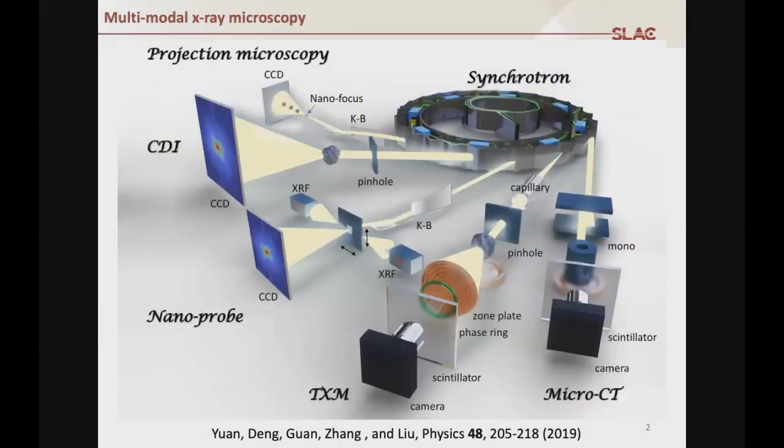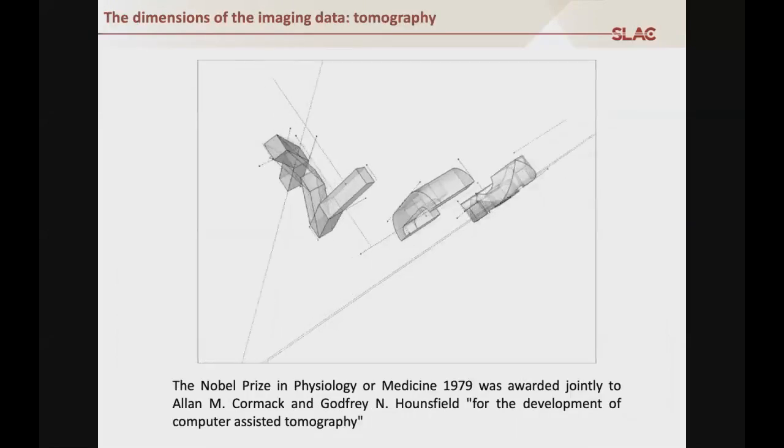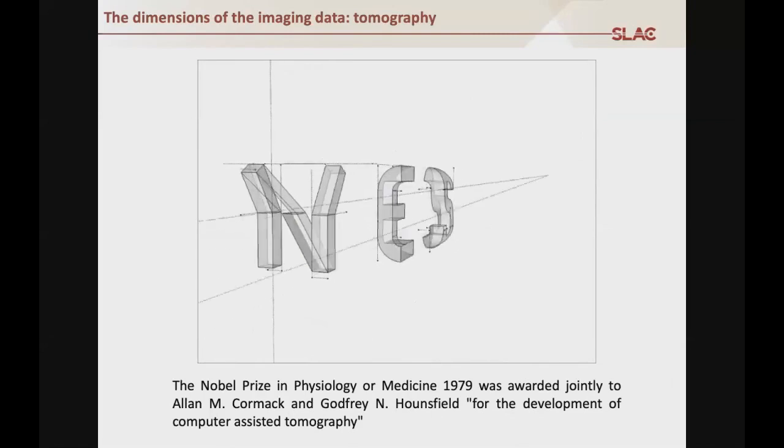X-ray has been used for imaging ever since it was discovered. In more recent years, thanks to the development of the synchrotron facilities, many different X-ray modalities have been developed and deployed at the large-scale X-ray facilities. The reason is very simple: there are so many different imaging modalities, and every one of them has pros and cons. Only if you combine different imaging methods can you have a more complete picture of the scientific case you are looking into.